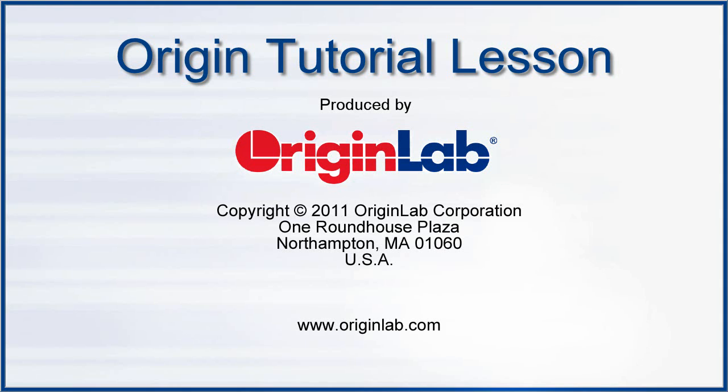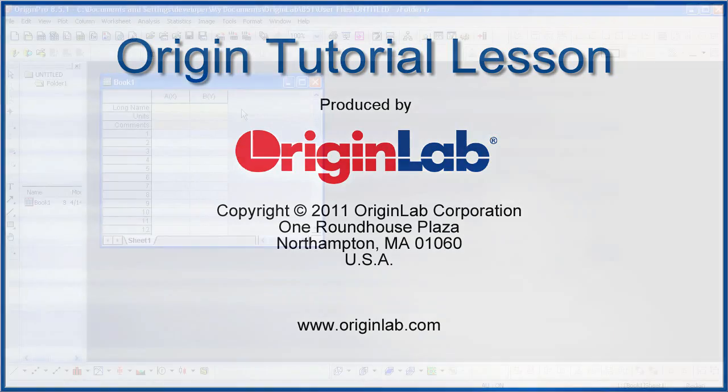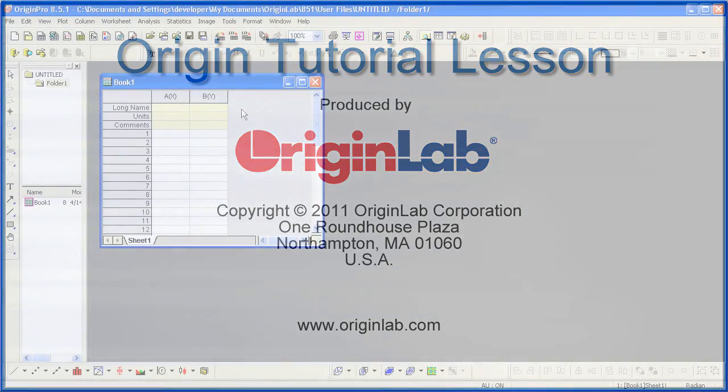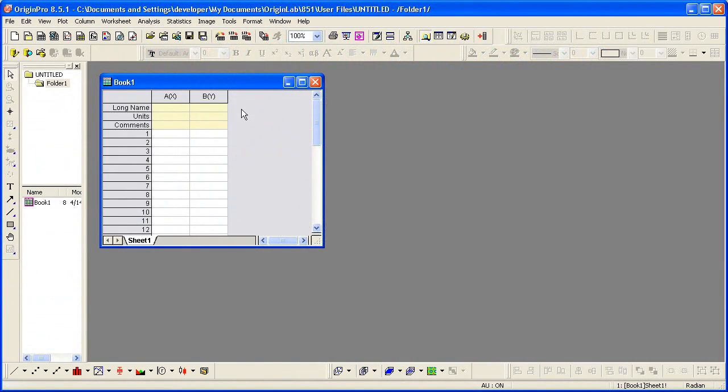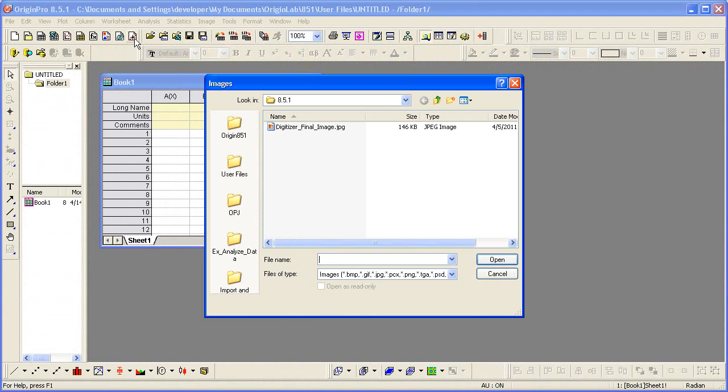The Digitizer allows you to capture data from images of graphs. To import an image file of a graph into Origin and digitize data points one by one, click the Digitize Image button on the standard toolbar.